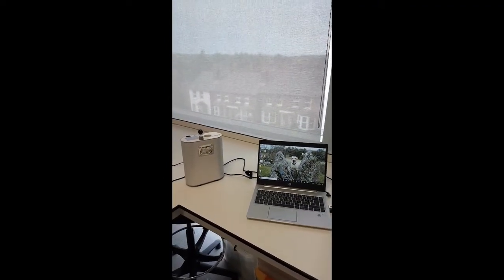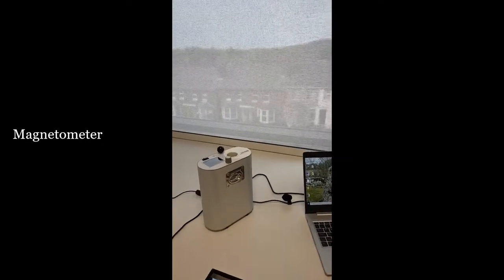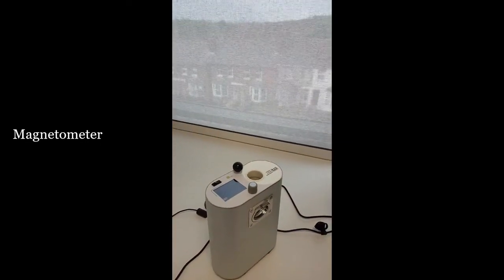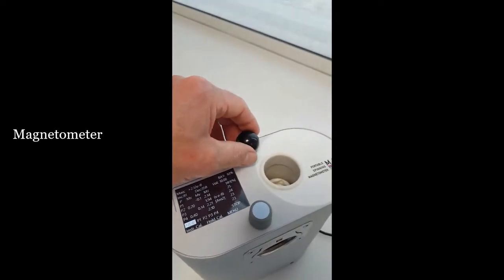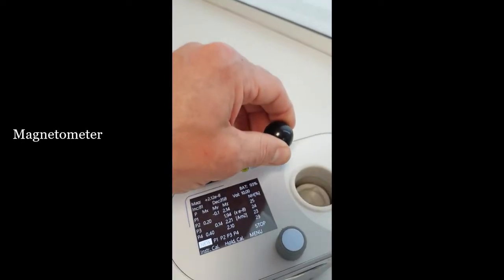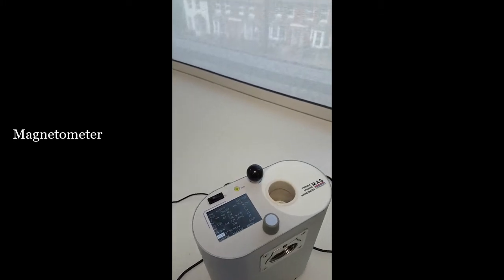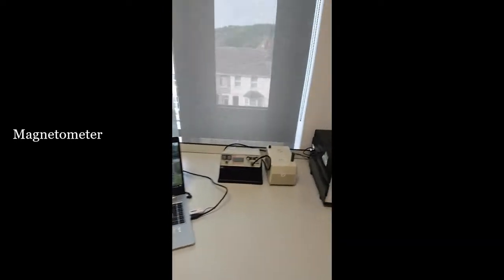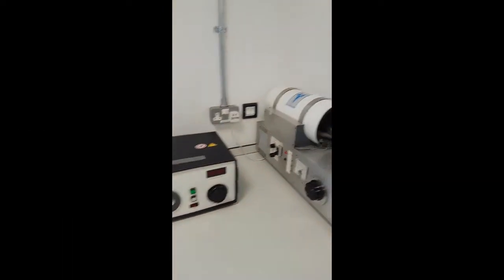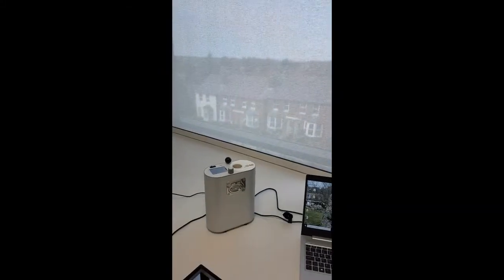But before I forget, let's get to my latest and newest addition to my magnetic lab. So this is my magnetometer. With this magnetometer, we can measure the weak magnetic memories that are preserved by our samples. It consists of some very sensitive solid state magnetic sensors, and you drop your sample inside the instrument and it will work out the strength and direction of that magnetic memory. So there is my magnetic lab. Weak field, strong field, magnetization, remagnetization, demagnetization, and measuring the magnetic memory.